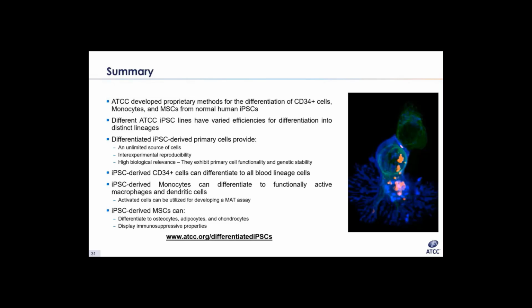So other things that they could be used for, they could be used to test immunosuppressive capacity. They can be used to study mechanisms for immunosuppression, maybe to evaluate anti-inflammatory responses to viral infection or the cytokine storm. Also, kind of a side note, the angiotensin converting enzyme 2, the ACE2 receptor, has been identified on hematopoietic progenitor cells.